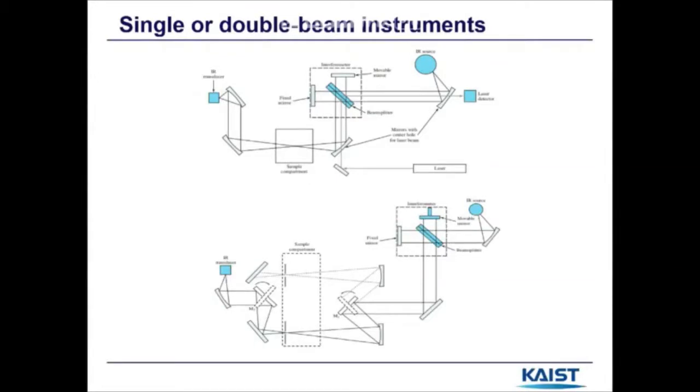A sample is then inserted in the radiation path and the process repeated. The ratio of sample and reference spectral data is then computed to give the transmittance at various frequencies. From this ratio, the absorbance is calculated as a function of wave number. Ordinarily, modern IR sources and detectors are sufficiently stable so that reference spectra need to be obtained only occasionally.